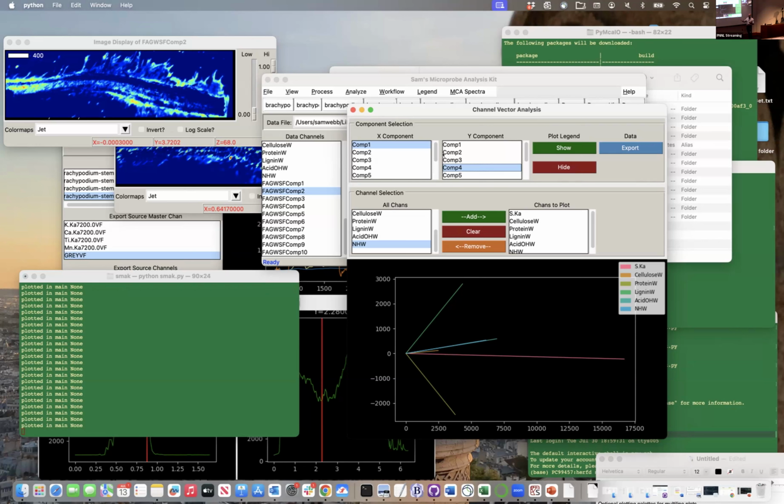But one of the things that really helped, because part of our data was only one corner of the micromodel versus the whole end of it, but the optical image had the whole end on it, was that I could see the writing of the 300 micron pores on the MALDI in one section, as well as my XRF data. So rather than correlating optical images, I was correlating one channel of the MALDI with one channel of the silicon etched in there, and that actually worked out really well. And so it's like trying to stretch what you can match, but there are things in the data sets you have to find, and you explore the data sets independently and see where can I find the same registers when you don't have all the supporting data.